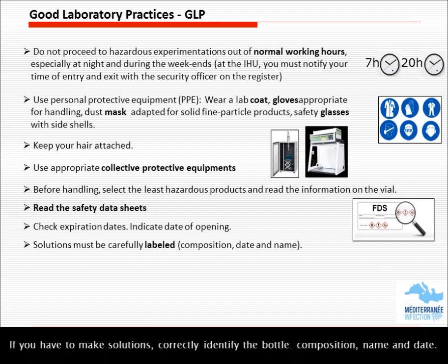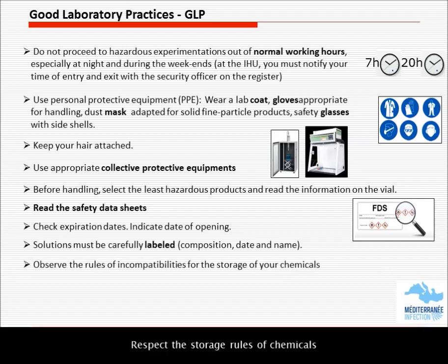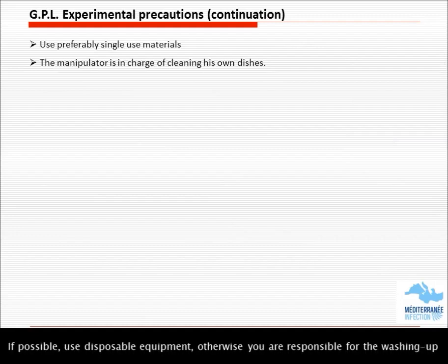If you have to make solutions, correctly identify the bottle, composition, name and date. Respect the storage rules of chemicals. If possible, use disposable equipment, otherwise you are responsible for the washing up.